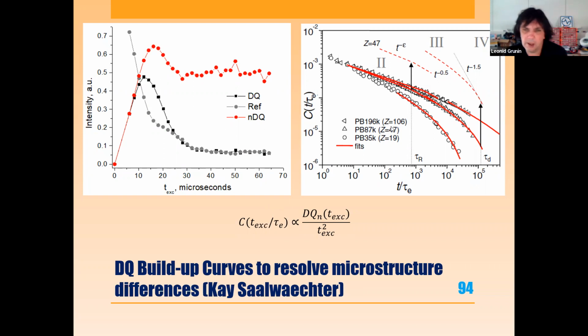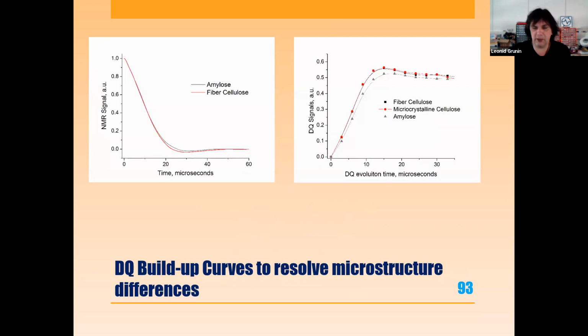Unfortunately, this approach has not really been developed up to now for rigid polymers, because the type of molecular motion is different, and we are not able to implement time-temperature superposition. But nonetheless, this is in progress, and investigating the correlation function of motions in crystalline and amorphous parts of sugar-type materials might be a good case to investigate while we still have this project, and even longer. So that is what concerns double quantum. Do you have some kind of guess what it is related to, or what the reason is, what the idea is, and so on?